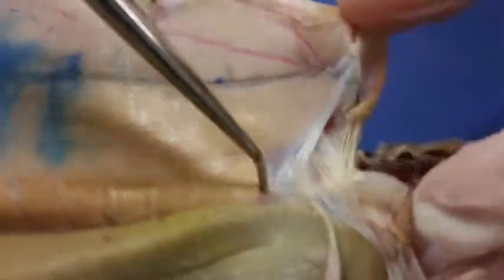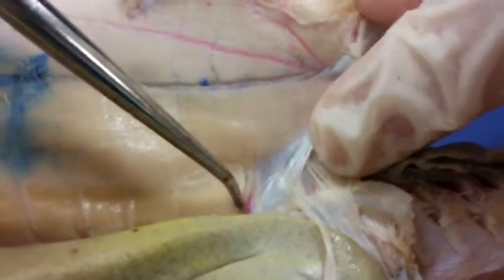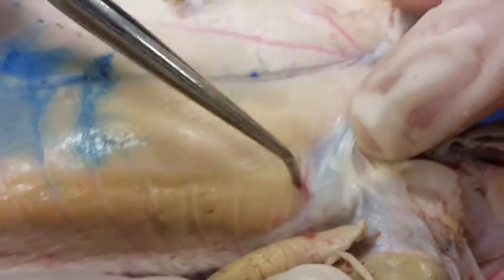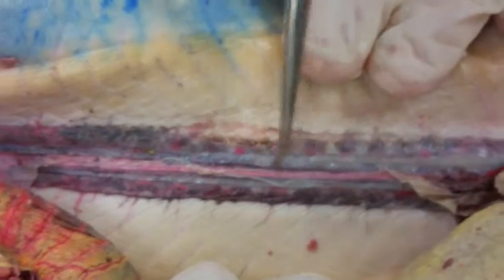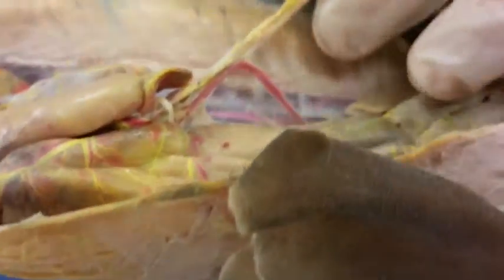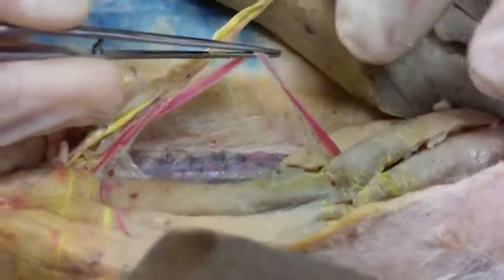Down here, we have very large and in charge, barely able to be seen at all, subclavian artery. Not very highly visible in ours, unfortunately, but subclavian artery, pretty important artery. Then we have the dorsal aorta, very obvious. And then our first big arterial branch is going to be this, which is the celiac artery.